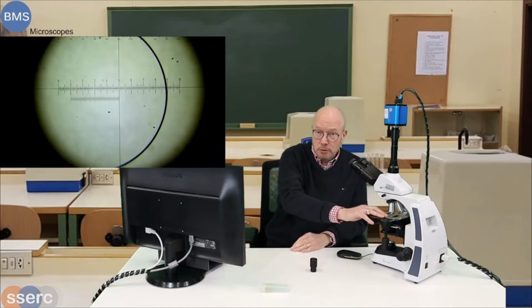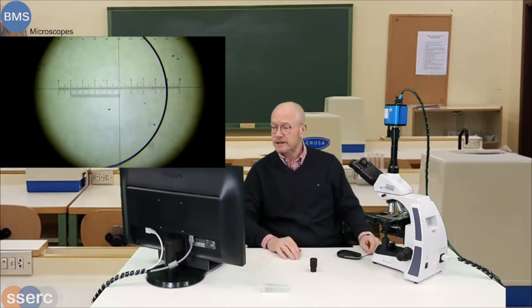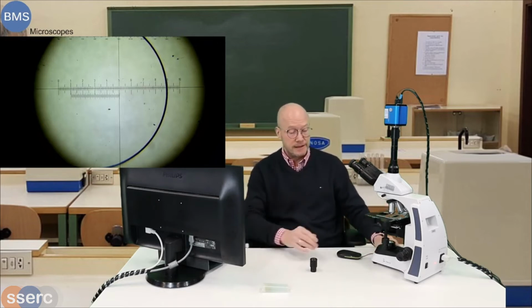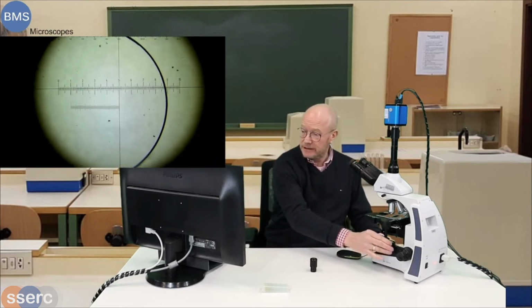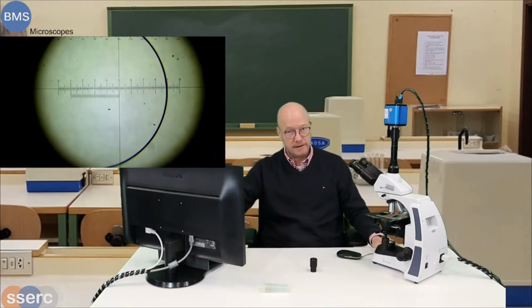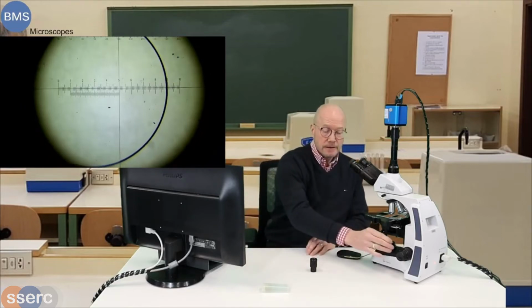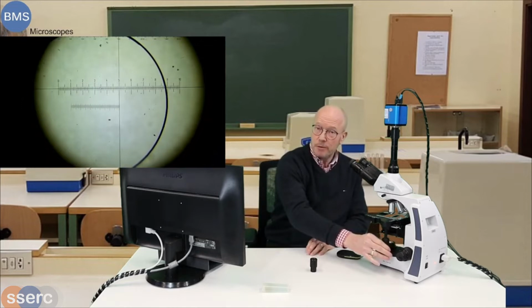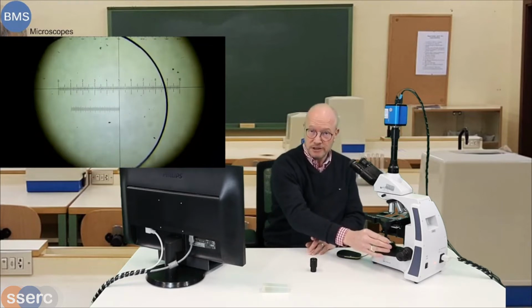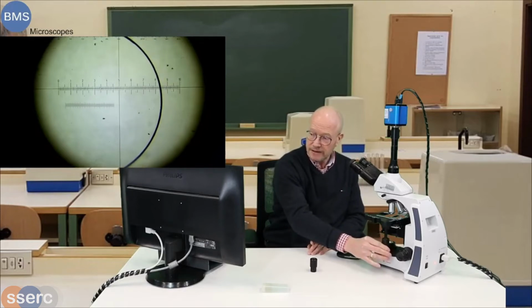First, we start with the smallest objective, the smallest magnification, which in this case is the 4 times. If you look at the image, you can already see in the back the stage micrometer moving here, and in front you see the ruler, the graticule inside the eyepiece. It's very handy to have a microscope with a mechanical stage if you want to do measurements, because you want a precise movement of your slide, like I do here.